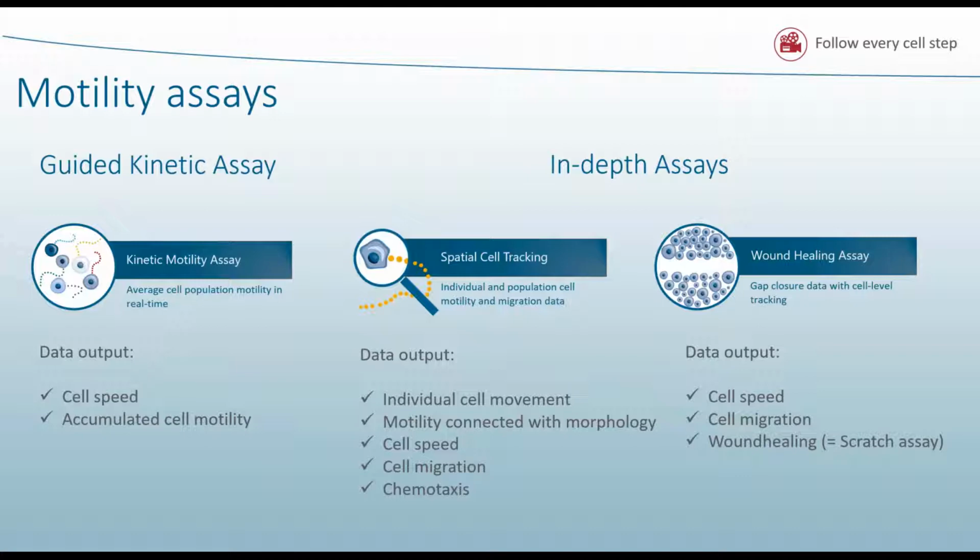Then last, we also have the wound healing assay, where you get cell speed, cell migration, and you can get the gap closure on the wound healing. So you can combine the wound healing with the spatial cell tracking.